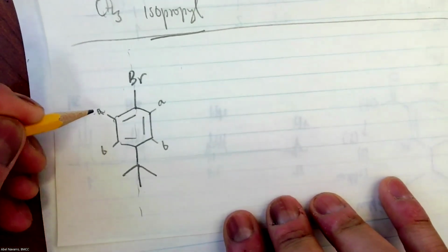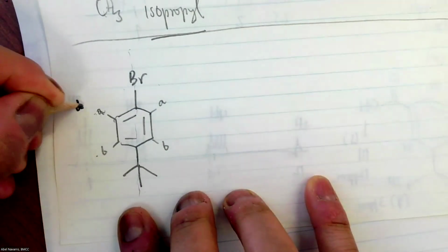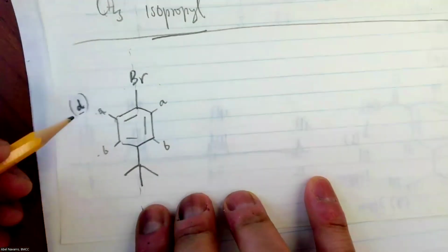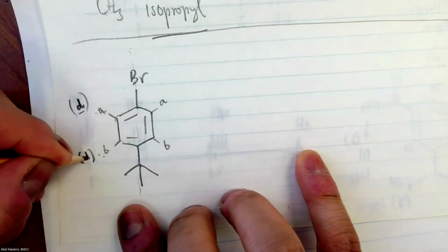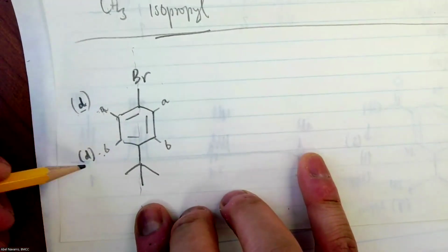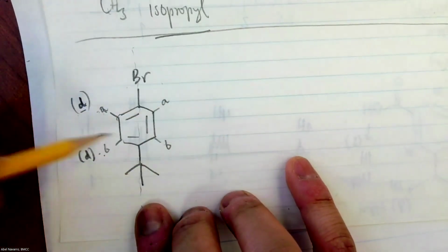Why? Because A is neighbor to B, one neighbor, 1 plus 1, 2. So this one would be a doublet. And B is neighboring A, 1 plus 1, 2. So this is also going to be a doublet. So it will be 2 doublets in the aromatic region. What else? This is the same as this. This is the same as this.